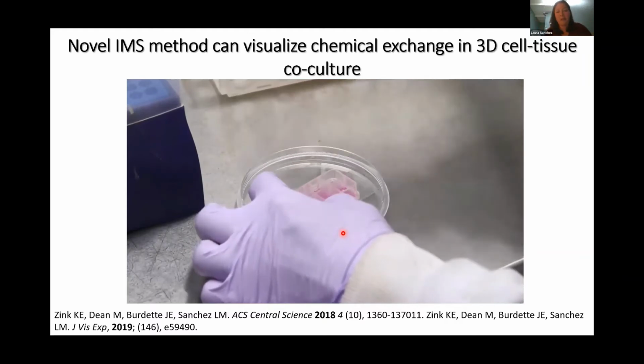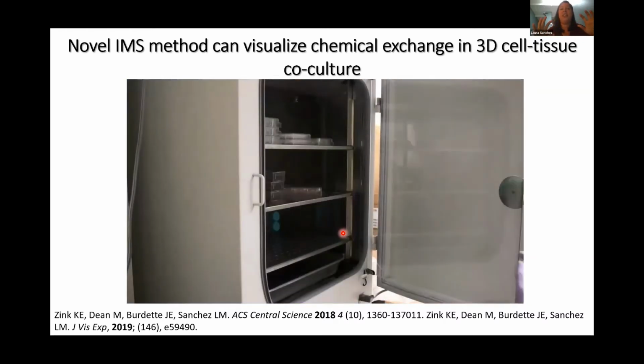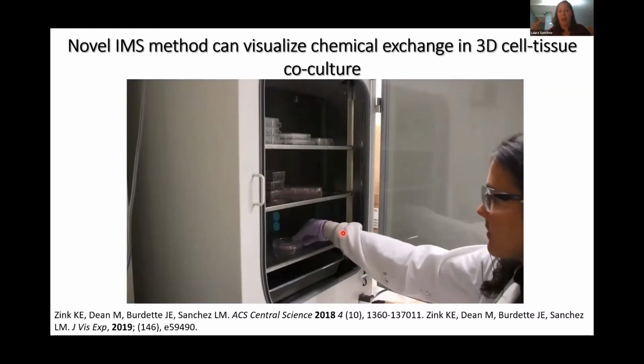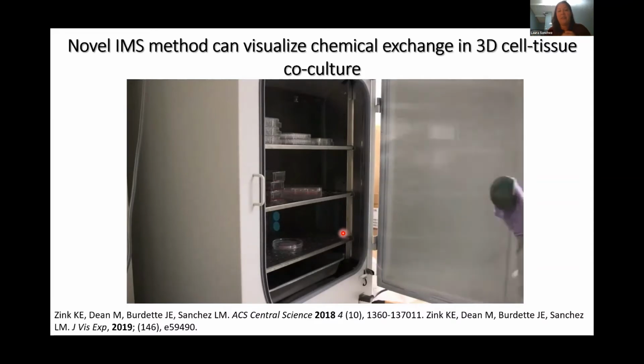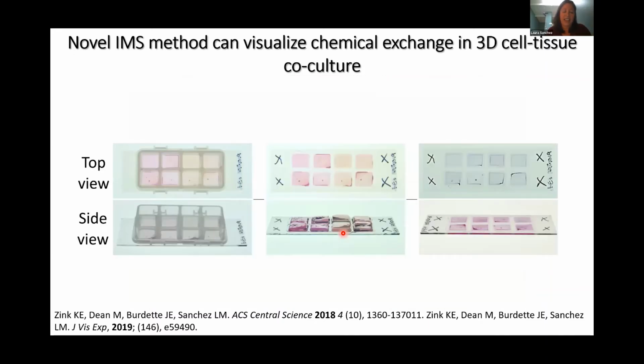So we place half of a murine ovary into the wells and then pipette the agarose, cells, and the media around it. We're going to allow these things to have chemical exchange for 4 days while they incubate before we actually then image them. And that took a lot of optimization. I've totally just trivialized probably like a year of Catherine's life, but there it is. And so this is just what this ends up looking like.